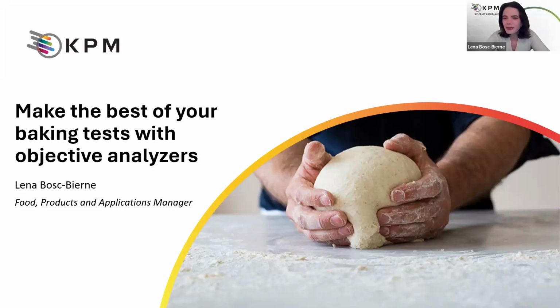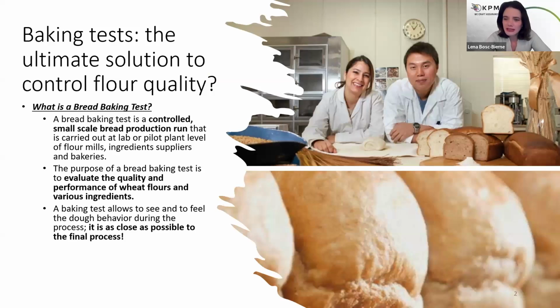Baking tests are used every day. This is a daily part of our job, and this is a very useful solution to better qualify flours, to better qualify ingredients, and also various impacts, but they are limited in their subjectivity. And so the idea is we agree that they are an important part of our job, but we can make them better. And this is a little bit what I would like to discuss today.